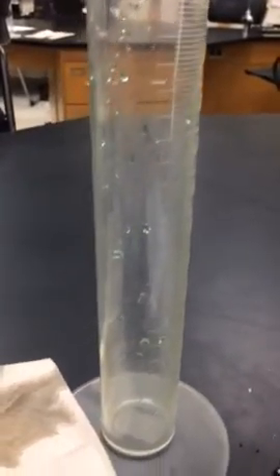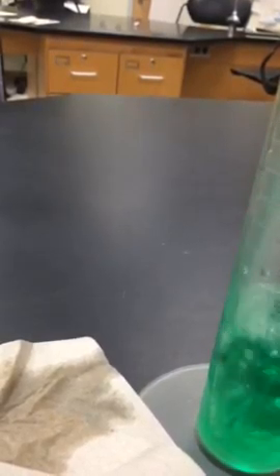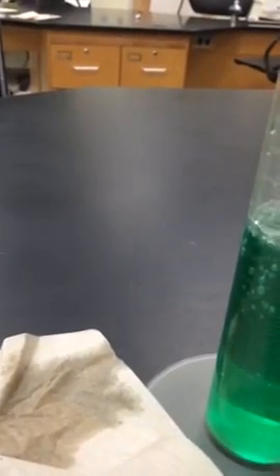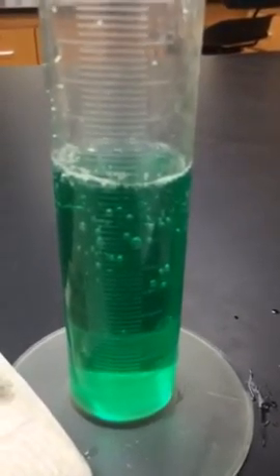Okay, next we need to find the volume of our cube. So we go to our graduated cylinder. We're going to pour up to 100. Turn so I can see it better. A little bit more. Perfect. Okay, so our initial volume is 100 milliliters.